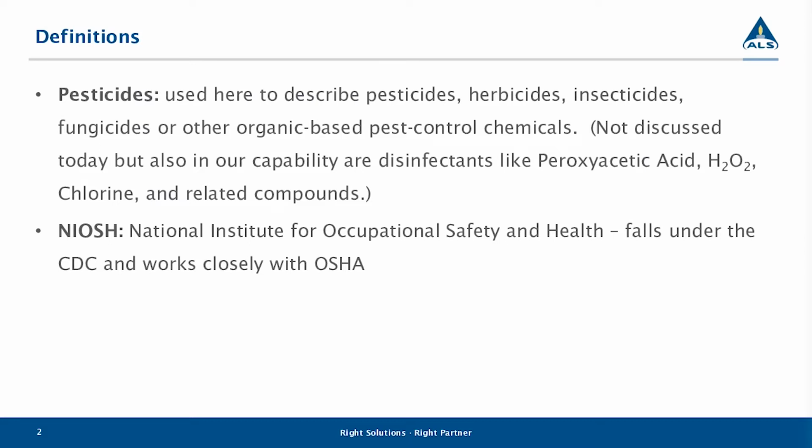So that's part of why we wanted to discuss this in a webinar, is to give you an idea of not only is this a wide class of compounds, it's something that we have a wide amount of availability for testing. One of the things I'm specifically not going to discuss today are disinfectants. Those are things you're probably seeing in the medical industry or in things like indoor pools and public facilities. Disinfectants like peroxyacetic acid, chlorine bleach, hydrogen peroxide. Those are actually capabilities we have for testing in occupational air and surface wipes, but that is a discussion for a different day.